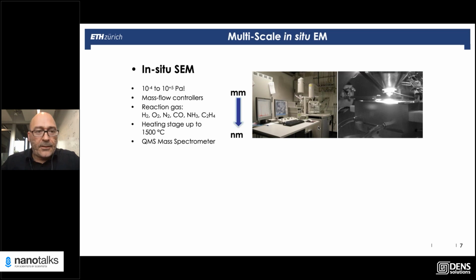What we have started to do when I was still in Berlin is we have slightly modified a conventional scanning electron microscope, an environmental scanning electron microscope. And we use this to study macroscopic samples. You can put in quite big samples in there, down to the resolution limit of a few nanometers in that microscope. Due to some modification to the differential pumping setting, we did experiments up to 1 bar in that instrument. So we can bridge a quite large pressure range.